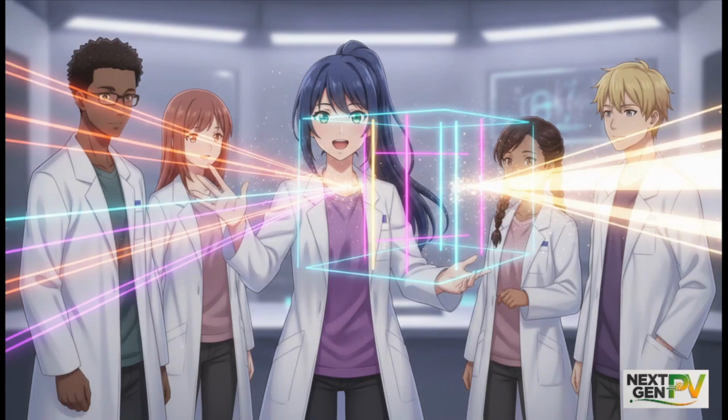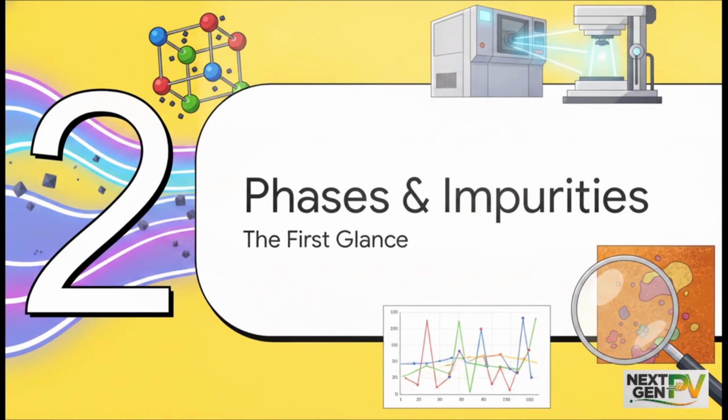The math behind all this is beautifully captured by Bragg's law. nλ = 2d sinθ. Let's break that down carefully because it's important. Here, λ is your X-ray wavelength. Most laboratory instruments use copper K-alpha radiation, which sits at about 1.5406 angstroms. That d right there is the crucial spacing between the crystal planes, and θ is the Bragg angle. So by simply measuring that diffraction angle, 2θ, we can directly determine the interplanar spacing, d. It's the foundational mathematical link between the diffraction pattern we capture on the screen and the physical reality of the perovskite crystal structure.